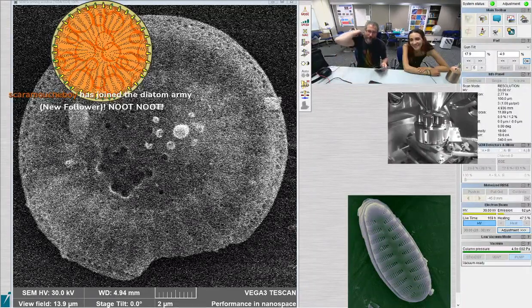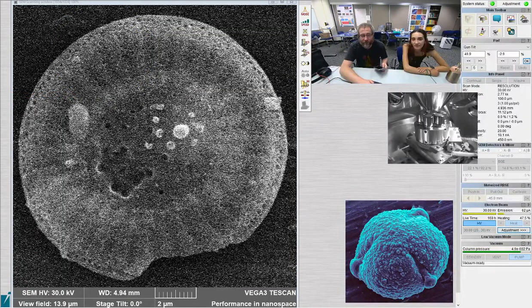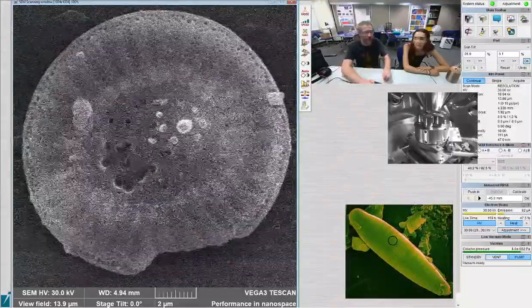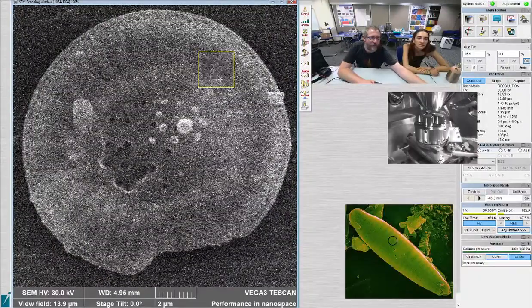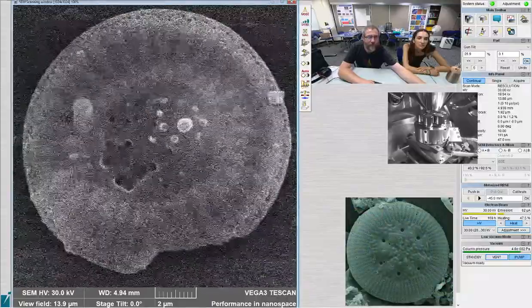What makes it drift? Normally, the drifting is because it's usually the temperature that's not quite right. So usually a heating adjustment will fix it. But the heating adjustment didn't seem to stop it from drifting anymore. So I thought maybe I would try the column wobble centering. Column centering is step 2, but usually if those are working together, it won't drift at all, for this instrument anyway.